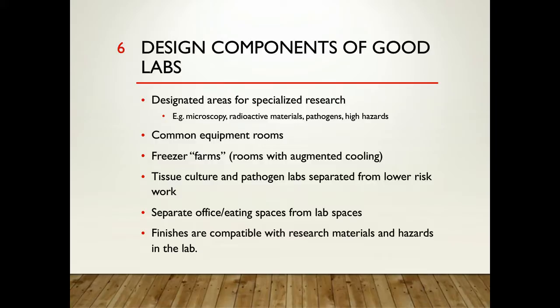Additionally, separate spaces for tissue culture and pathogen work should be designed so they can be separated from lower risk work, just to ensure that the people working with those lower risk items aren't exposed to those higher risk agents in the lab.